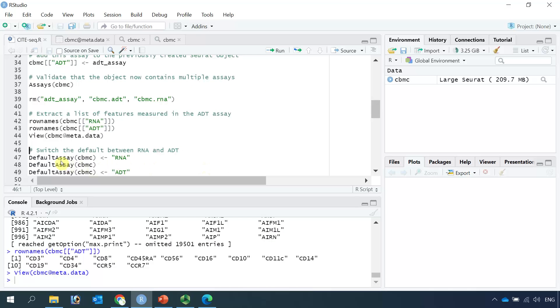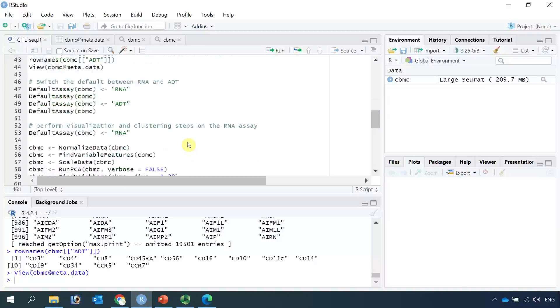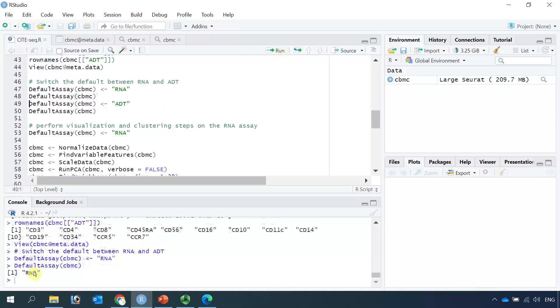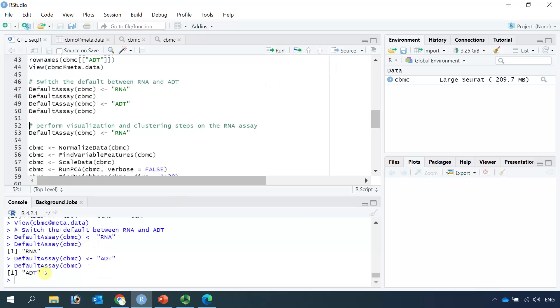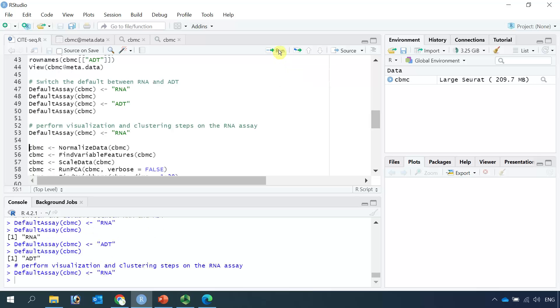We can use the DefaultAssay function to switch the assay between RNA and ADT. If we set the default assay as RNA and check it, you can see the default assay is RNA. We can switch it to ADT and check again — you can see now the assay is ADT. We are going to perform visualization and cell clustering on the RNA assay, so we need to switch back the default assay to RNA. Then we can run the standard workflow analysis.